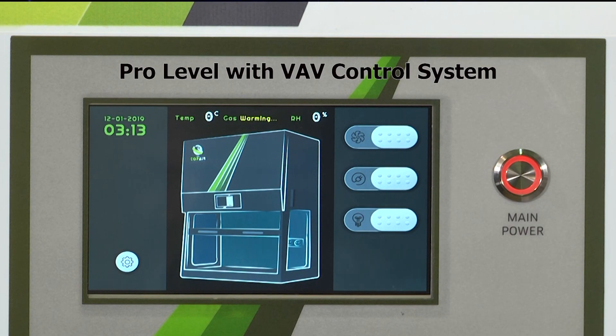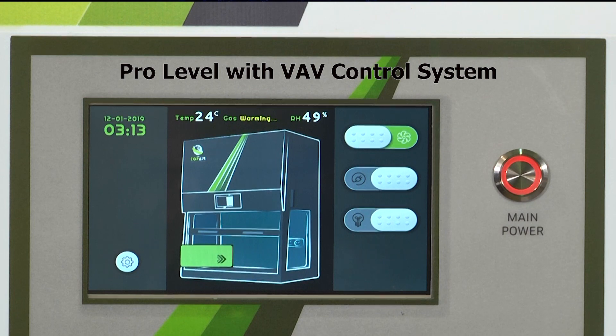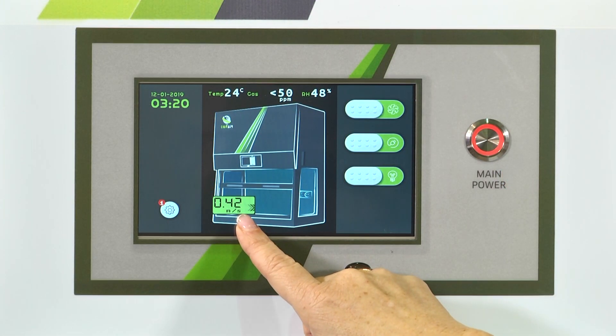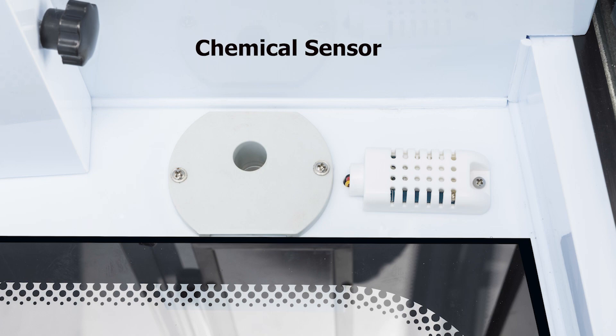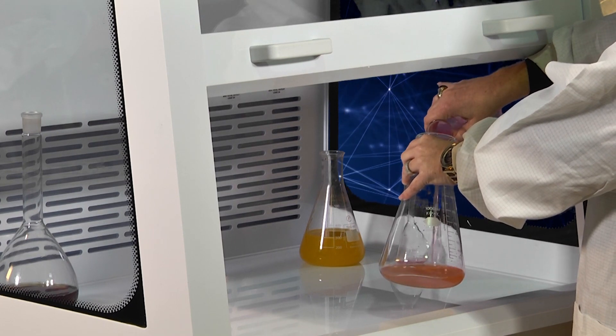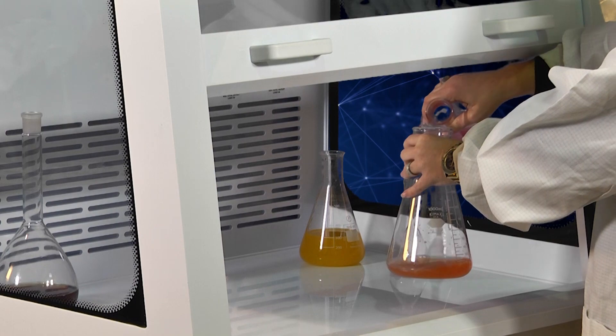The Pro model features a 7-inch touch screen and a wide variety of features that optimize safety, including a smart VAV control system. The VAV system maintains the selected air velocity and uses a sensor to detect the presence of staff nearby, accordingly opening or closing the window automatically, while also adjusting the air velocity to maximize power savings and safety and minimize noise.